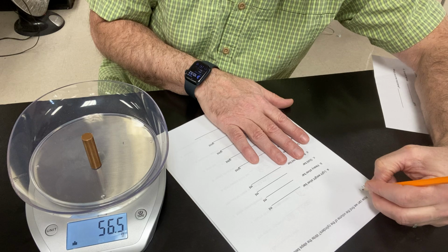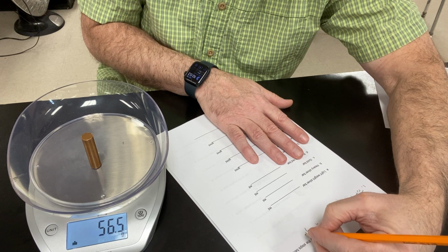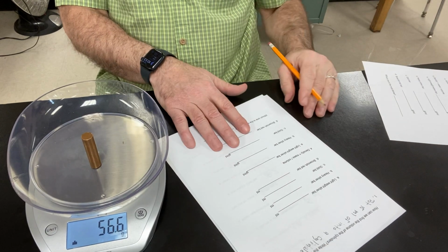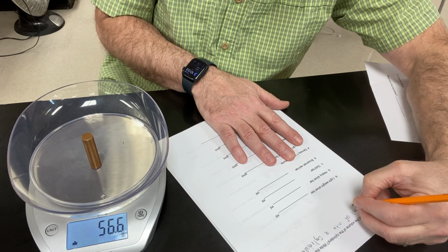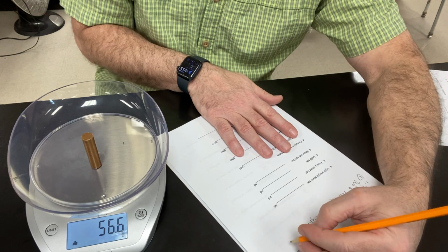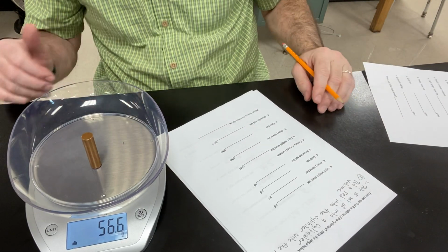So 1, put 15 ml of water into a cylinder. Oh, geez. Messed up the spelling. My fault. Okay. And step 2. Put a rod into the cylinder. Note the new volume, because it'll go up. The rod pushes the water up, and that's what we call displacement, when it pushes the water up.